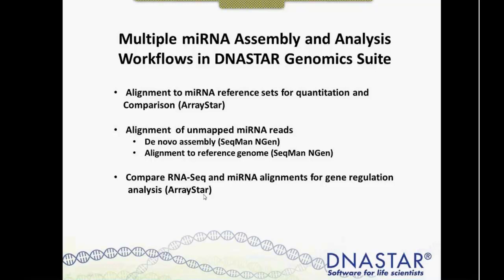And then there are some other ways to work with microRNA data. For example, if I have RNA-Seq data and miRNA data for the same RNA data set, I can compare changes in gene expression to the miRNA that's detected for those genes.